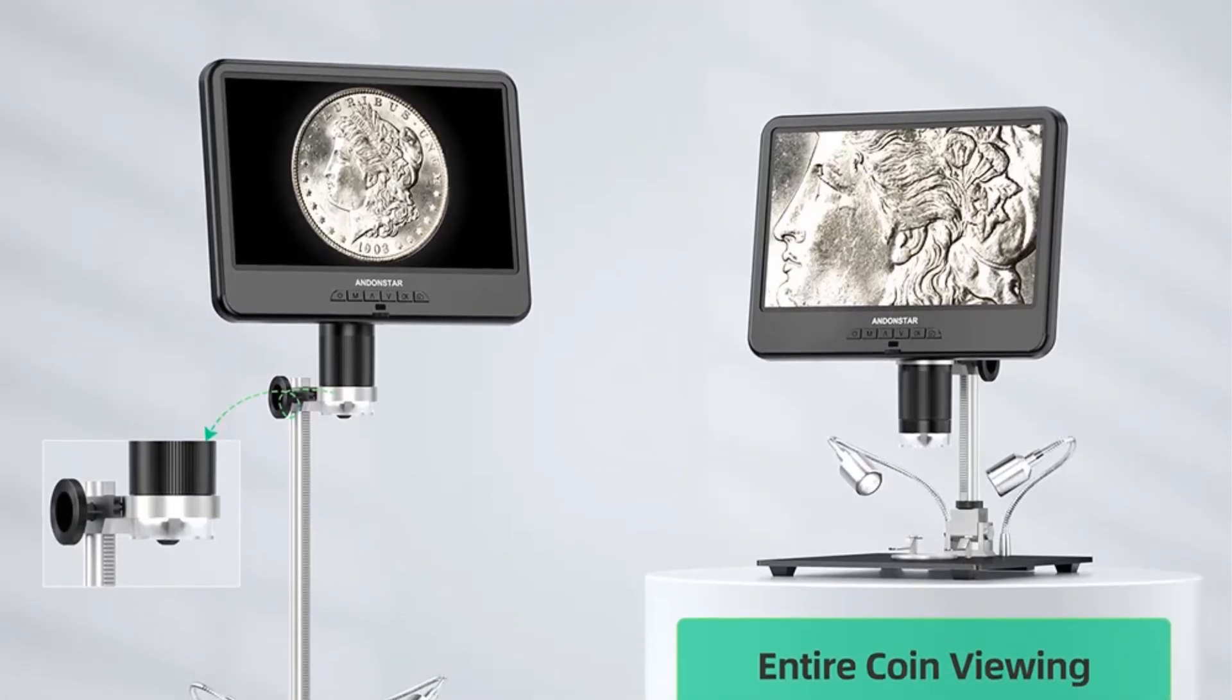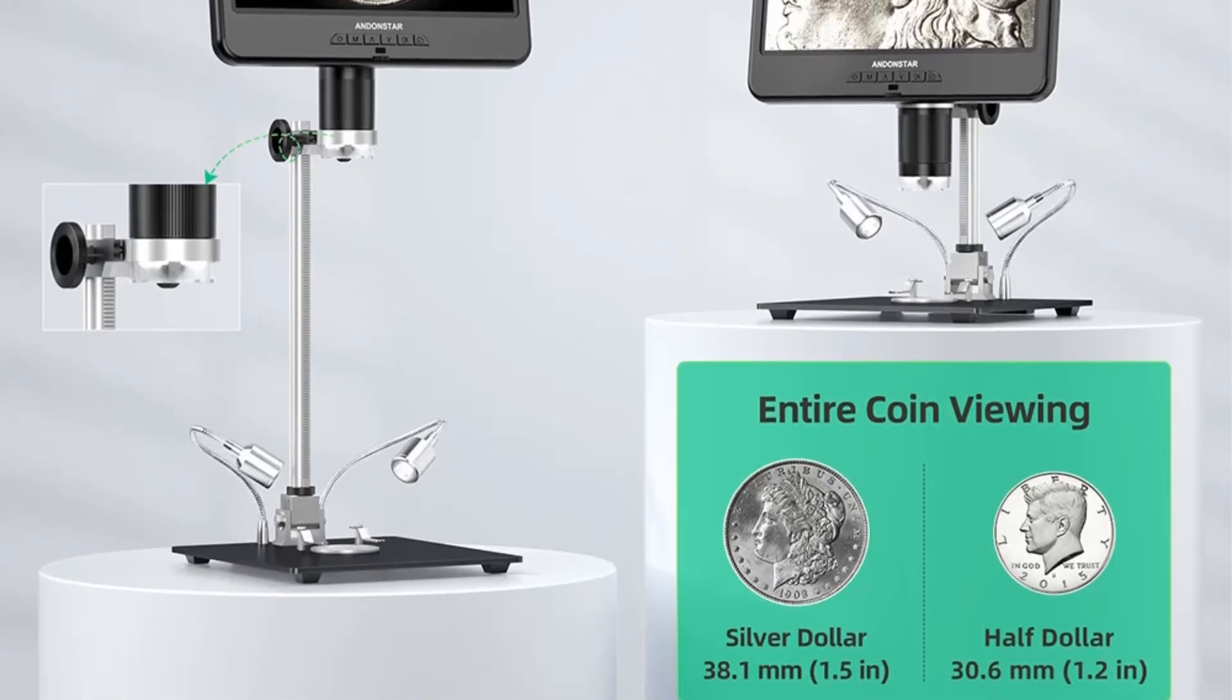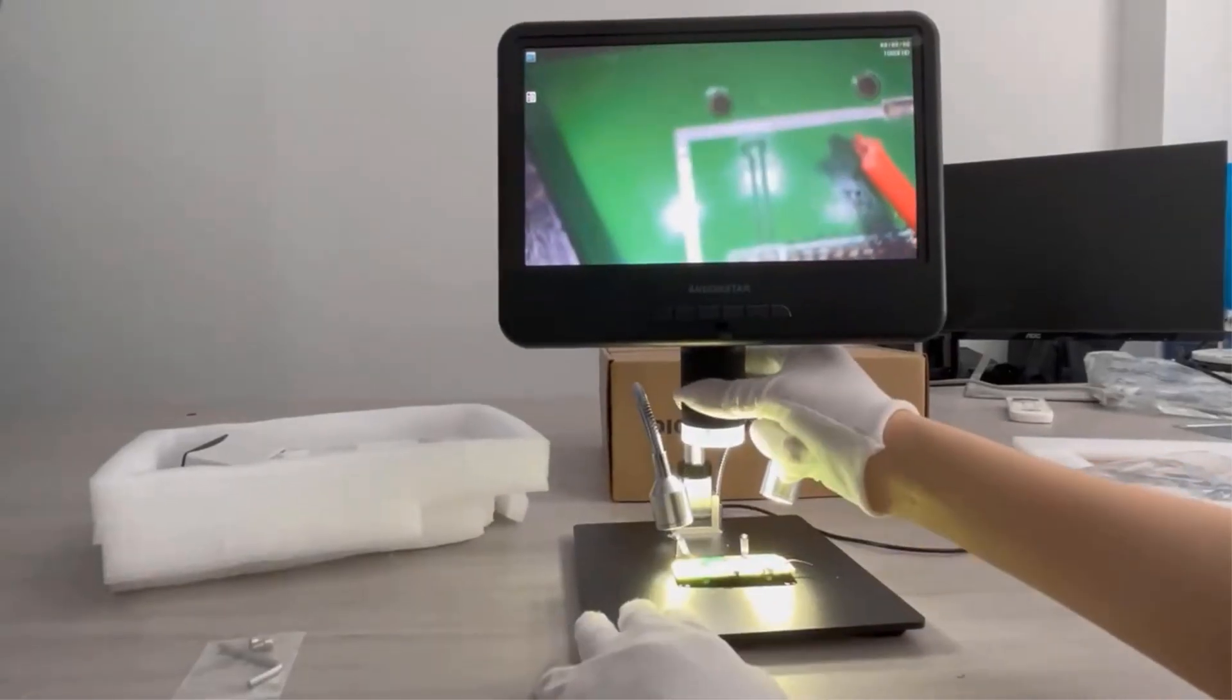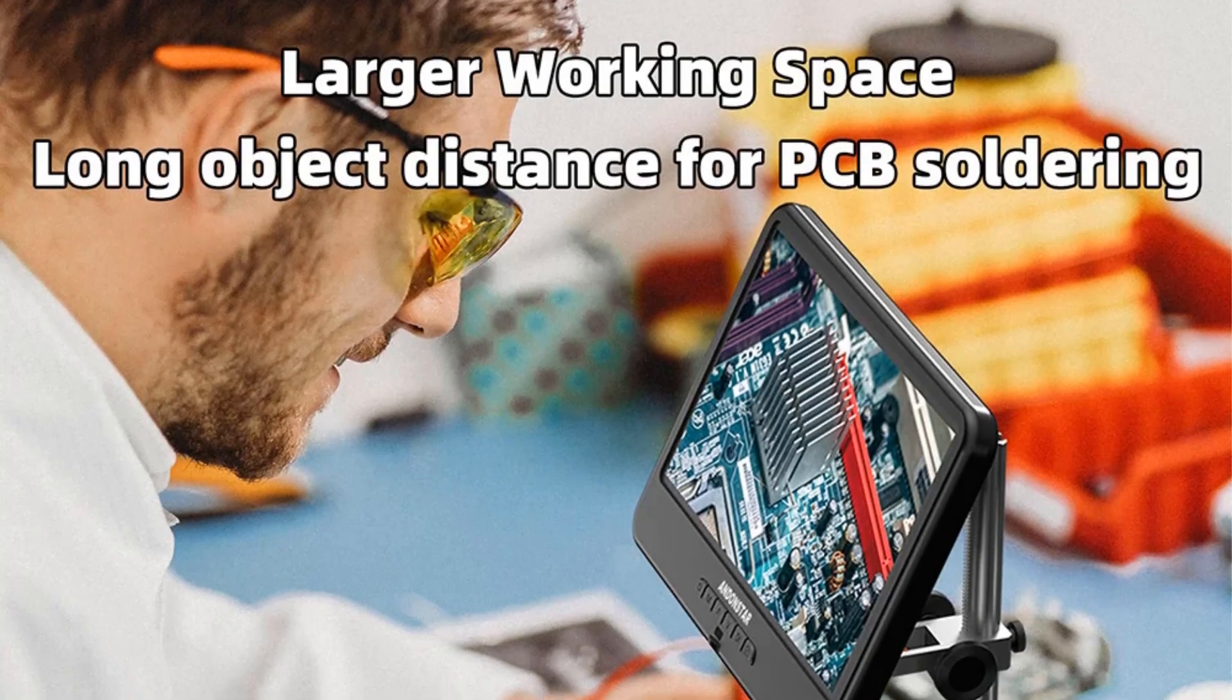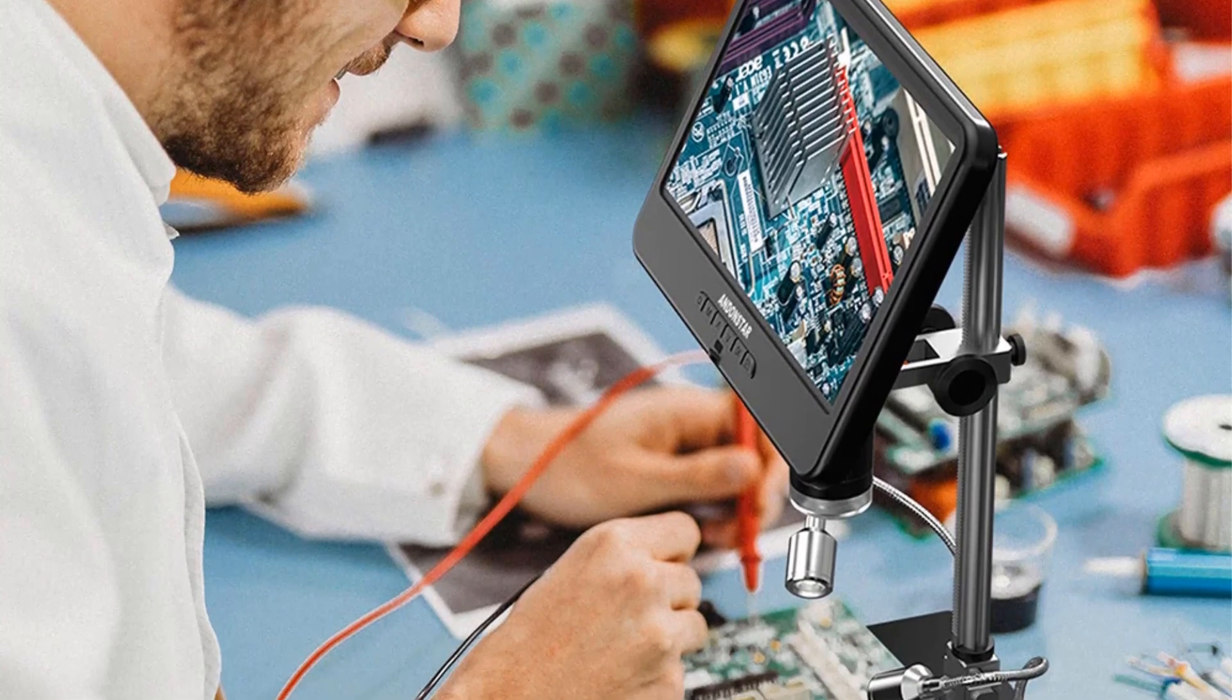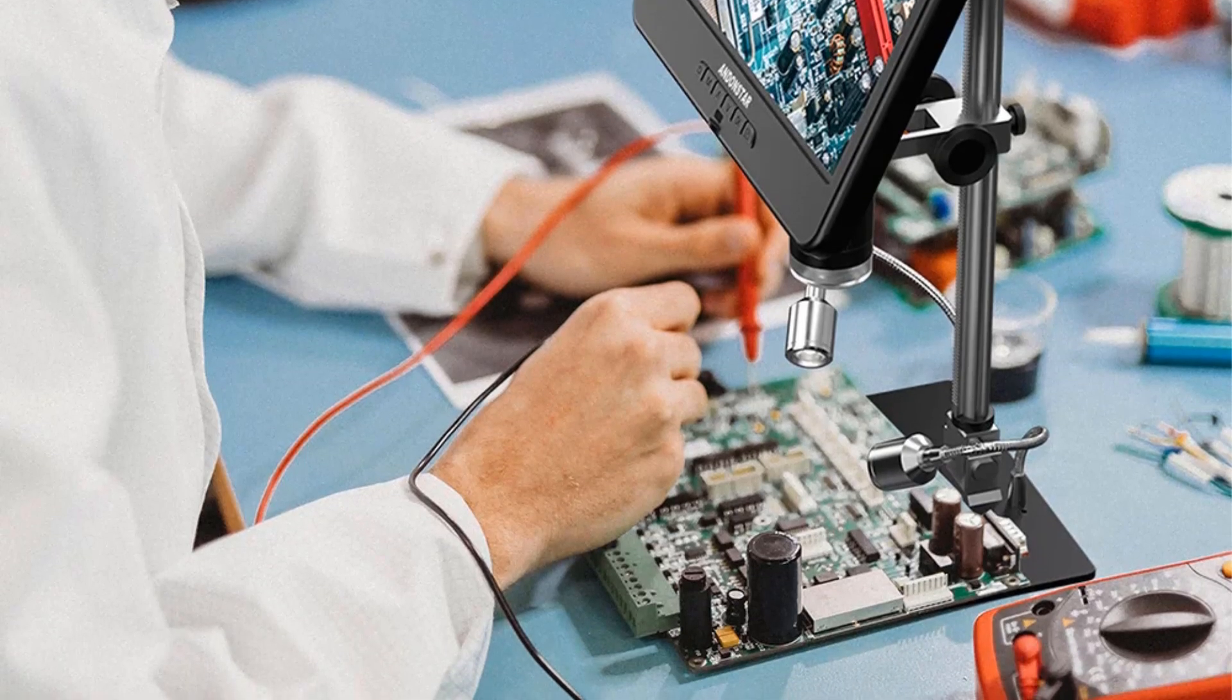The device operates on a USB 5V DC power source and comes with dual-fill lights for enhanced visibility. Certified by CE, FCC, and ROHS, the AD210 is constructed from durable metal and includes a range of accessories such as a metal stand, remote control, and user manual. It supports multiple languages, making it user-friendly for a diverse audience. The package weighs approximately 1.85kg and offers an efficient solution for detailed inspections and monitoring.